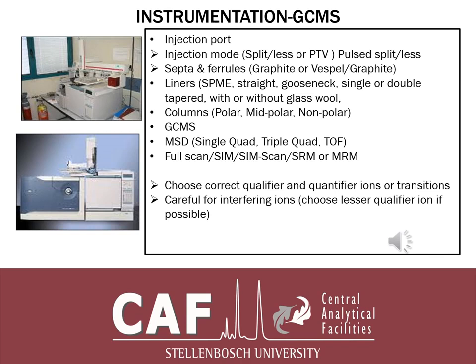In the injection port, one will talk about the injection mode, where you talk of split or splitless injection or PTV, programmed temperature vaporizer, and also the type of splitless injection can be pulse split or splitless, and some manufacturers call it the program vaporization, if I'm not wrong. Sorry, I beg your pardon. They call it a pressure surge.